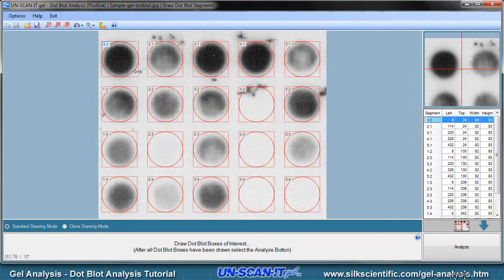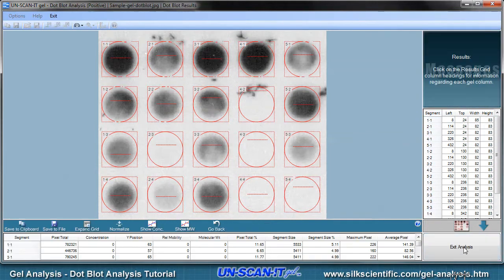After all the segment boxes are correctly placed on the image, click the Analyze button in the lower right corner of the screen. The Unscannit Gel software will analyze the pixel intensities of each segment box oval region and quantify the results for each blot. After all the dot blots have been analyzed, the results screen will be displayed. Clicking the column headings will display a description of the data in that column.